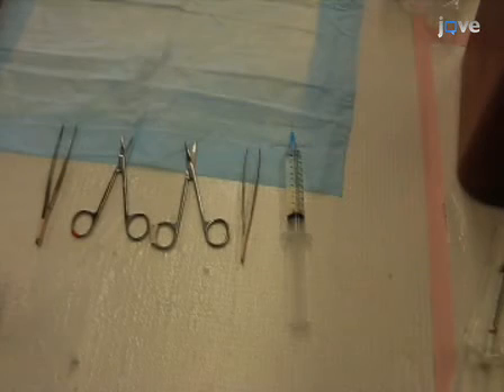To begin you'll need a 10 ml syringe with a 25 gauge needle filled with PBS, a pair of curved forceps, a pair of straight forceps, sharp scissors, and a pair of blunt scissors that can be used to clip bone.